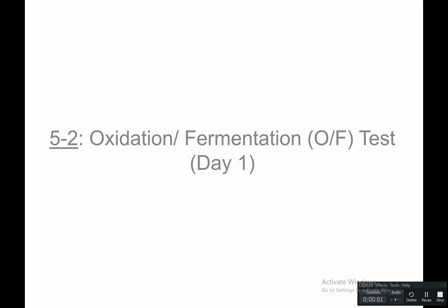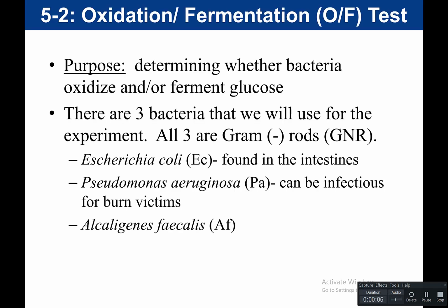So now we're going to move on to our oxidation fermentation or OF test. So for this test, you want to know the purpose. And the purpose of this test is to determine whether bacteria can oxidize and or ferment glucose. So not only are we looking at do they metabolize glucose, but do they do it in the presence of oxygen, which is oxidize, or do they do it in the absence of oxygen, which would be our fermentation?